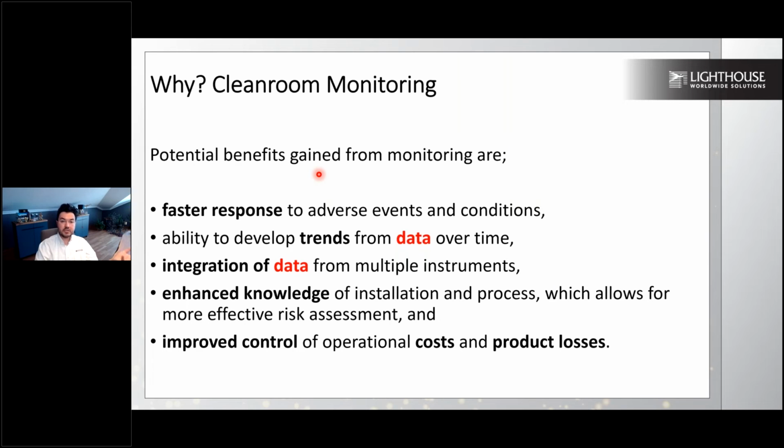limits. However, GMP itself says that when you are using the monitoring requirements, you don't have to follow the table limits directly, but you can make your own limits. For example, for monitoring purposes, 5 micron is an early indication of our alarm limit. So set up 1 as, for example, a warning limit, and 2 as an action limit, because in any case, in every minute, if you are taking these 1 or 2 samples, then you will be in danger.